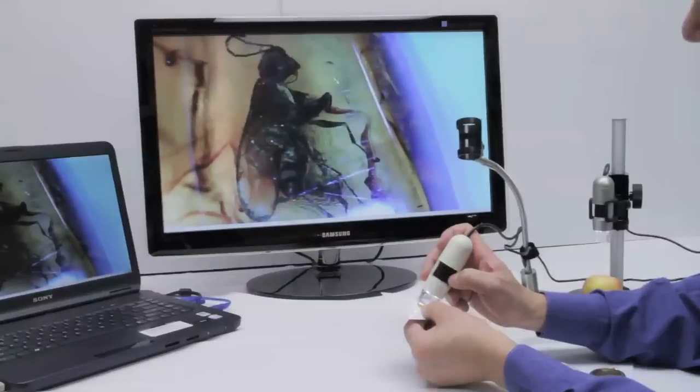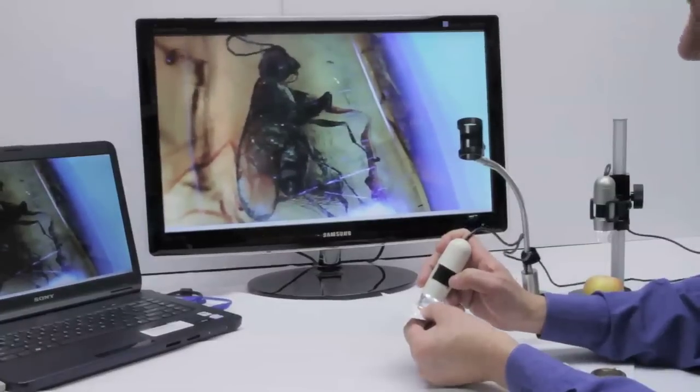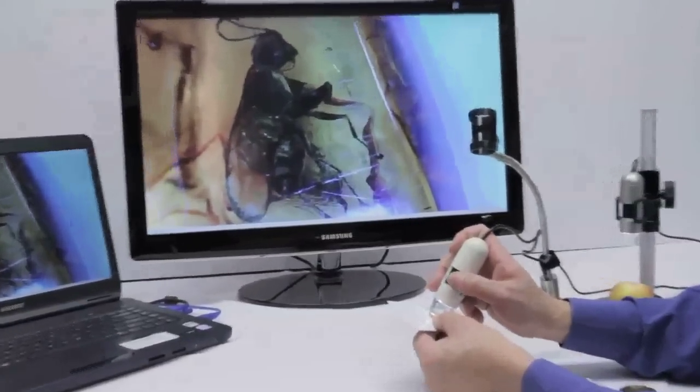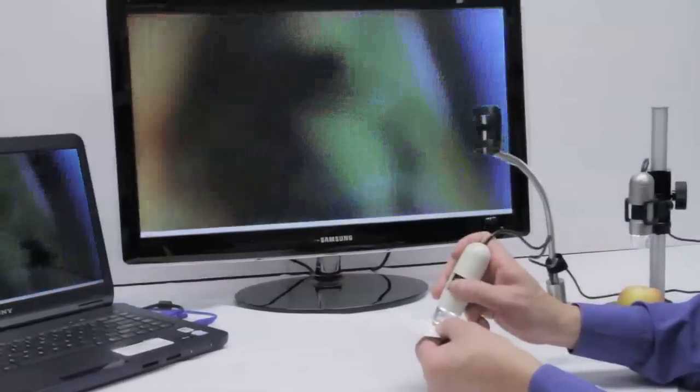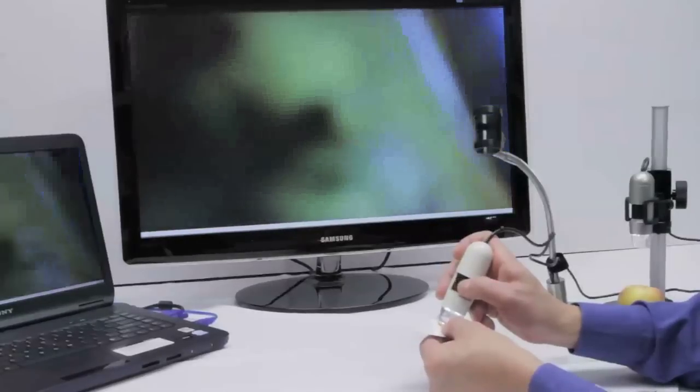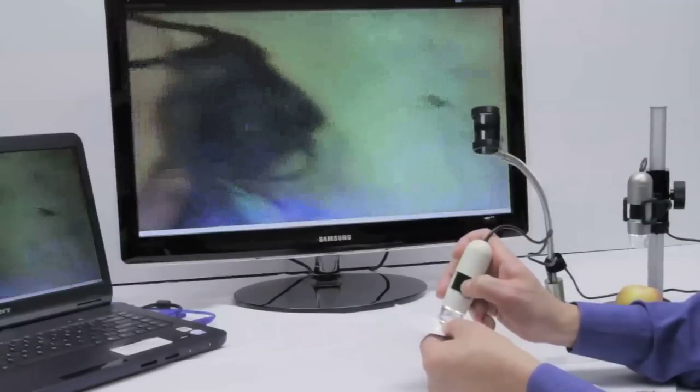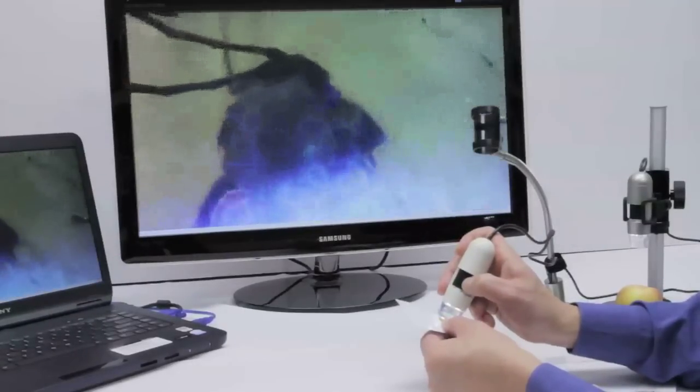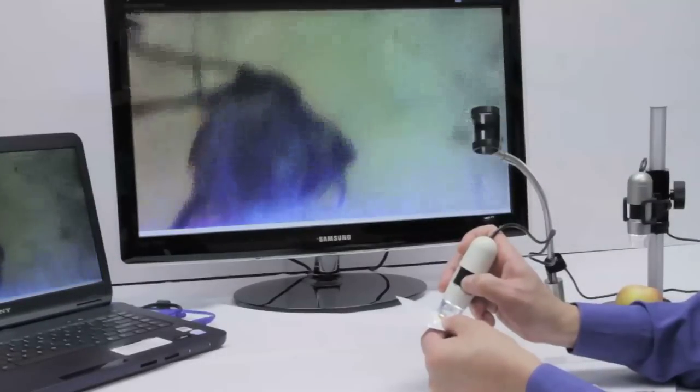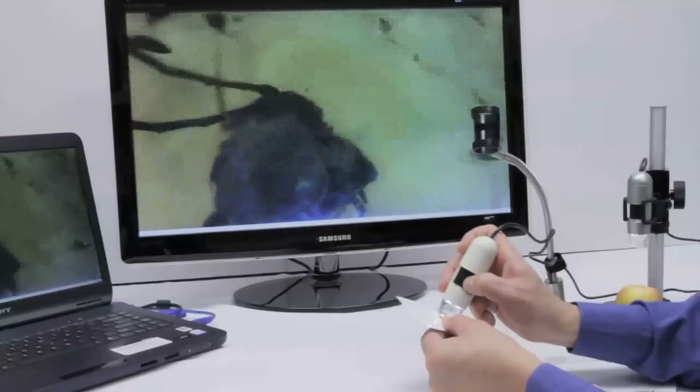And when using by hand at a zero working distance, so touching the object, we can achieve 50 as well as 200 times the magnification.